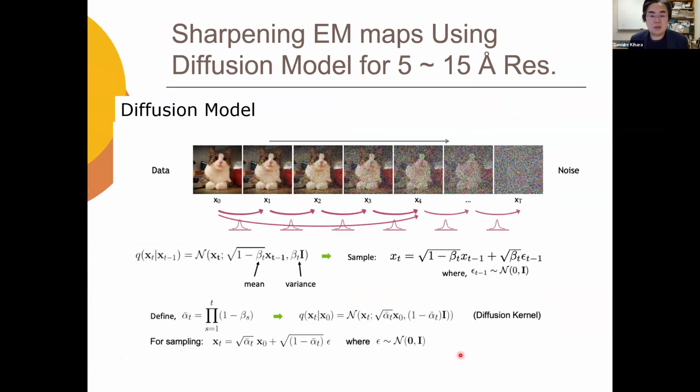All right. So I have just 3 more slides. This is our very recent development for modeling maps of 5 angstrom to 15 angstrom. I mentioned that DeepMainMast for proteins and CryoREAD for DNA RNA are for maps up to 5 angstrom.